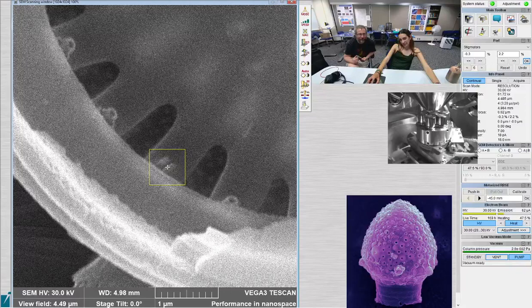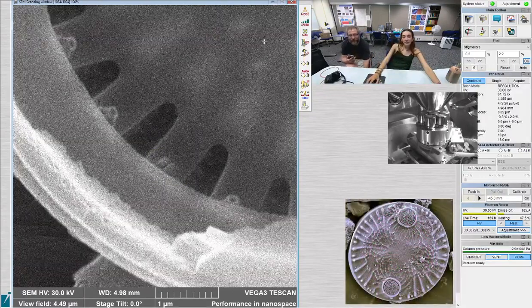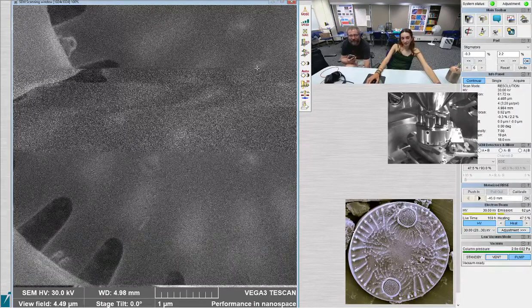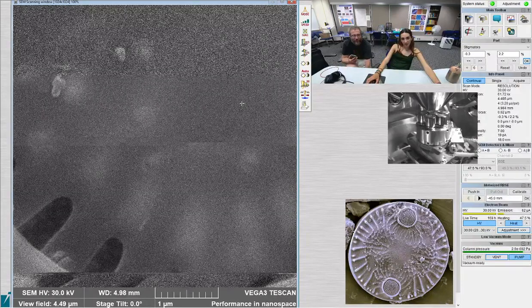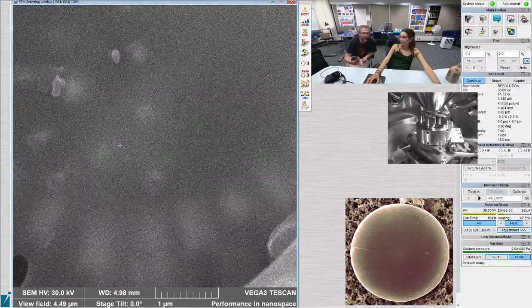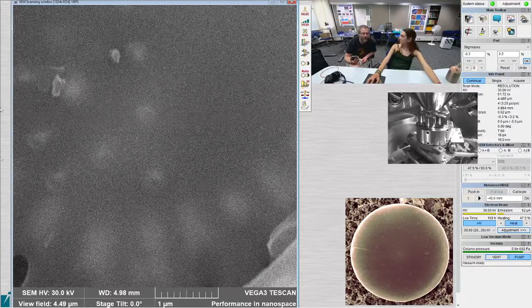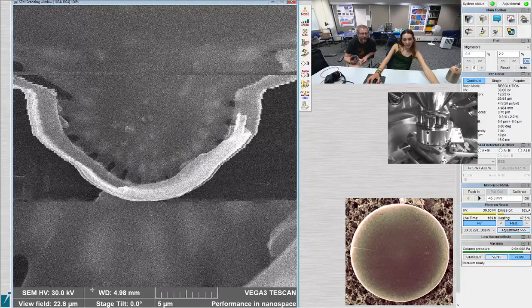You can't get everything in focus at once because we're so close to it. You've only got less than a micron's depth of field where we were. So these are the ones. Yeah, I don't know if we can see any sort of structure coming through on the other side of them. Do we want a picture of this part? Nah. We got it in the previous one. As good as we're going to get it.